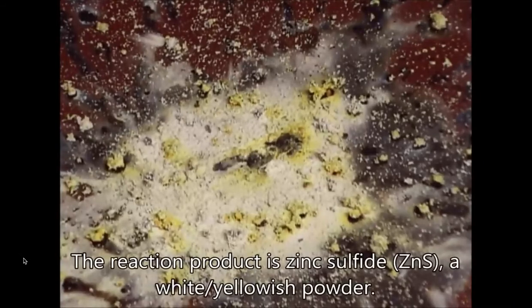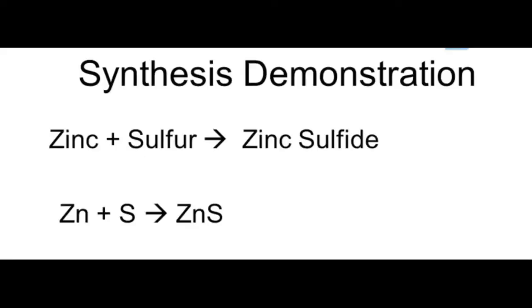So this is what the product looks like, zinc sulfide. It's a white yellowish powder. So in this demonstration, we see that zinc plus sulfur come together to yield zinc sulfide. So Zn plus S yields ZnS.